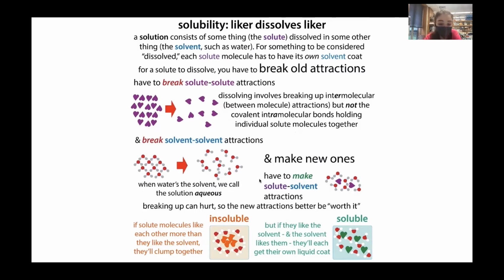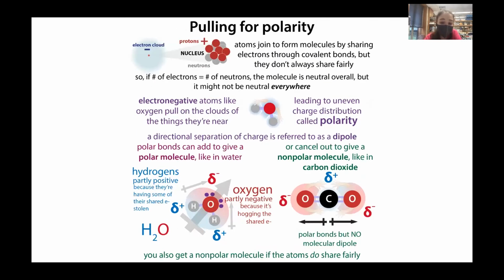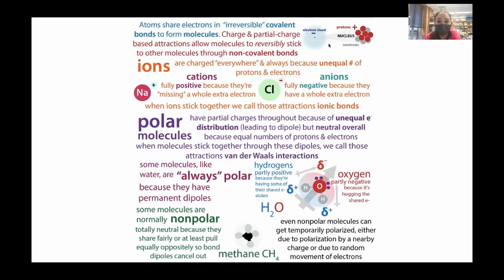The phenol and chloroform, they don't like the water, and so they're going to separate out and not be dissolved liquids. The reason why molecules do or don't like each other comes down a lot to polarity and partial charges. Molecules are made up of atoms, and these atoms are made up of smaller parts: protons, which are positively charged, and neutrons, and those hang out at the center in the central core called a nucleus.